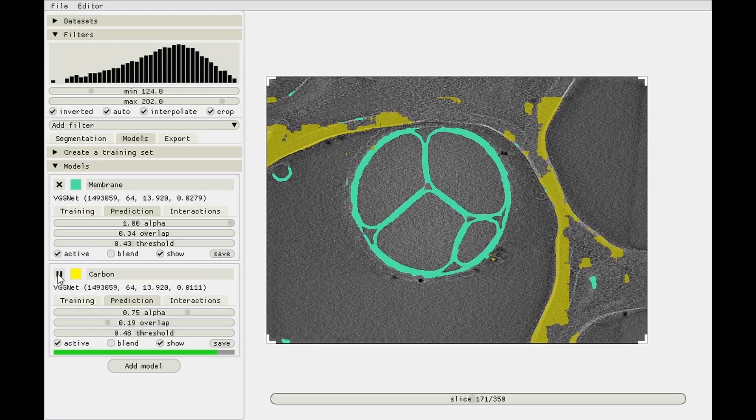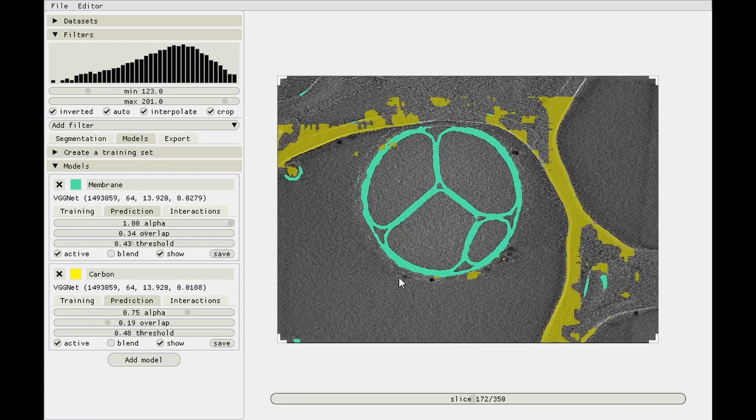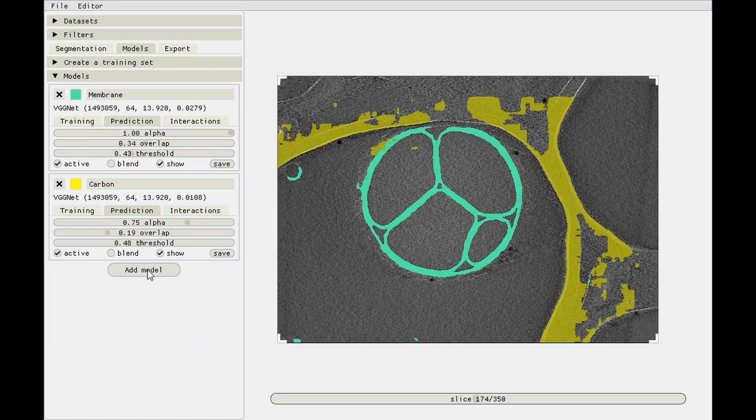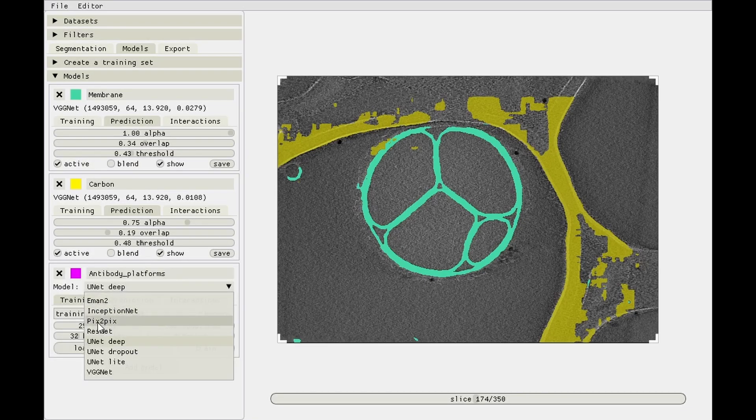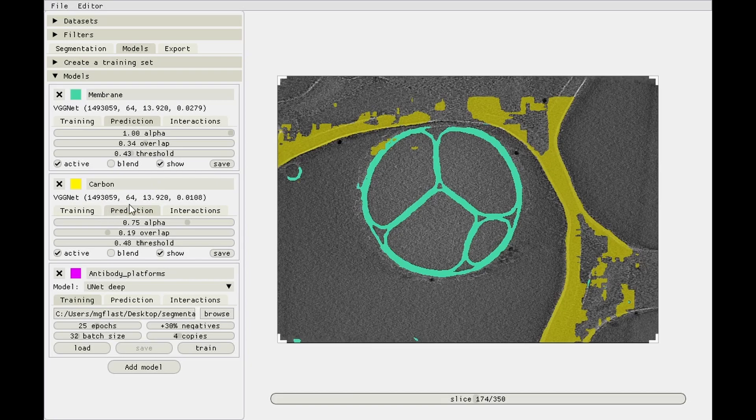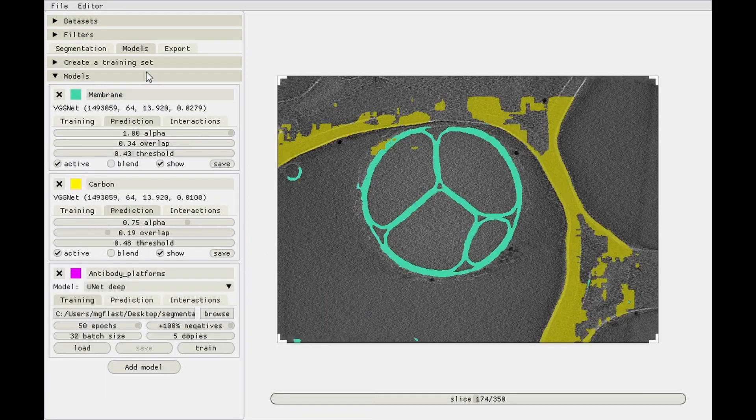Let's stop this one, it's alright. And then add the third model, which will be antibody platforms. In the paper we used Pix2Pix which is a bit slow to train so I'll not use it here. I'll just use a UNet Deep instead which is one of the fastest. VGGNet is also fast but for the carbon one I thought it was a bit slow so I'll leave it out for now. Same settings, five copies, or let's see how many particles we've got. 82, so we can use some more copies. Ten copies and train.